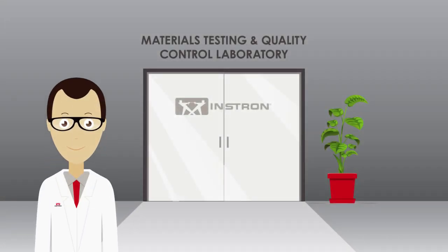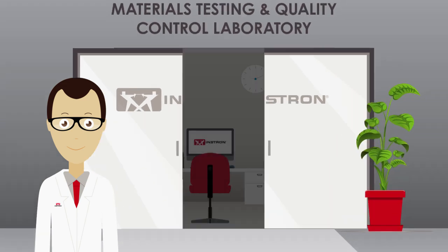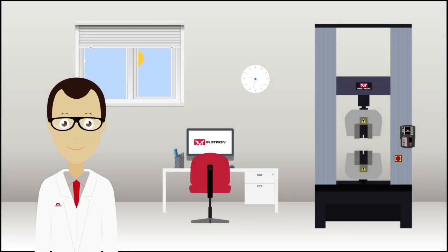Hi, my name is Pat, and I'm a lab technician. I'm responsible for running tensile tests so that production can ship our products. I run lots of tests every day, identical tests with lots of repetition.